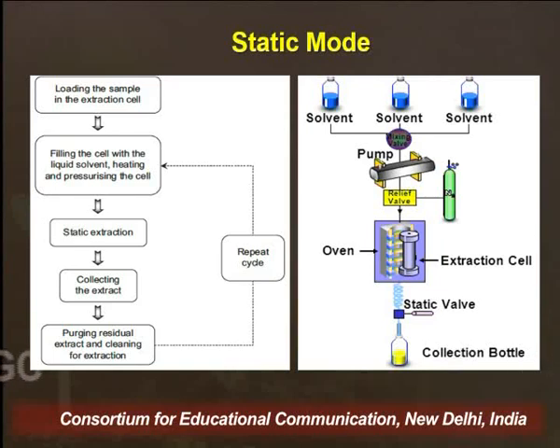Once that specified time period for extraction is over, the static valve is opened. Once the valve is opened, pressure is released, a pressure gradient develops, and the solvent or the extract that is present in the extraction cell flows into the collection bottle.